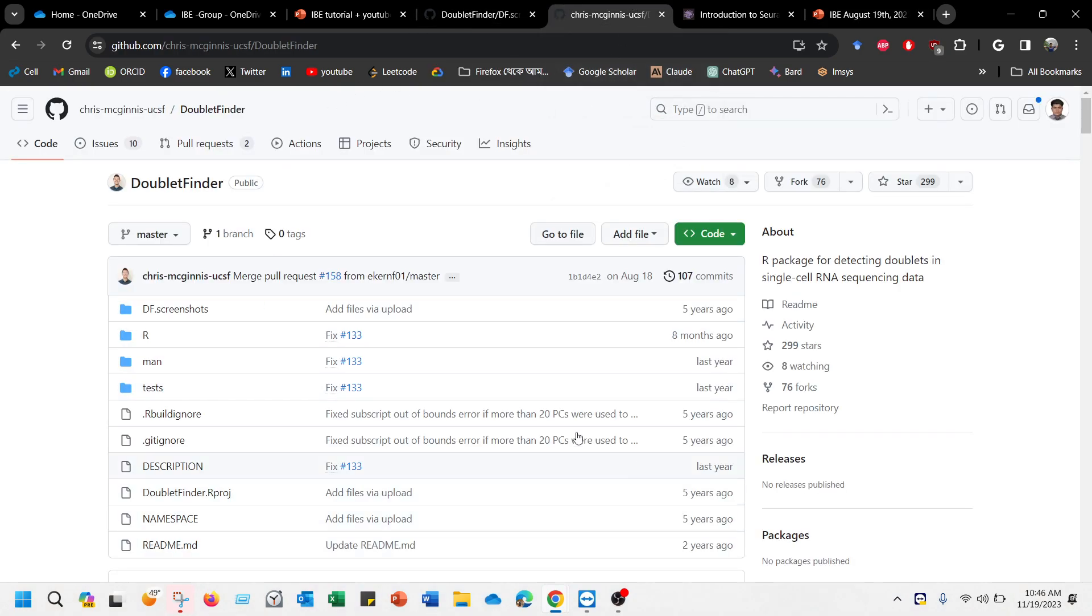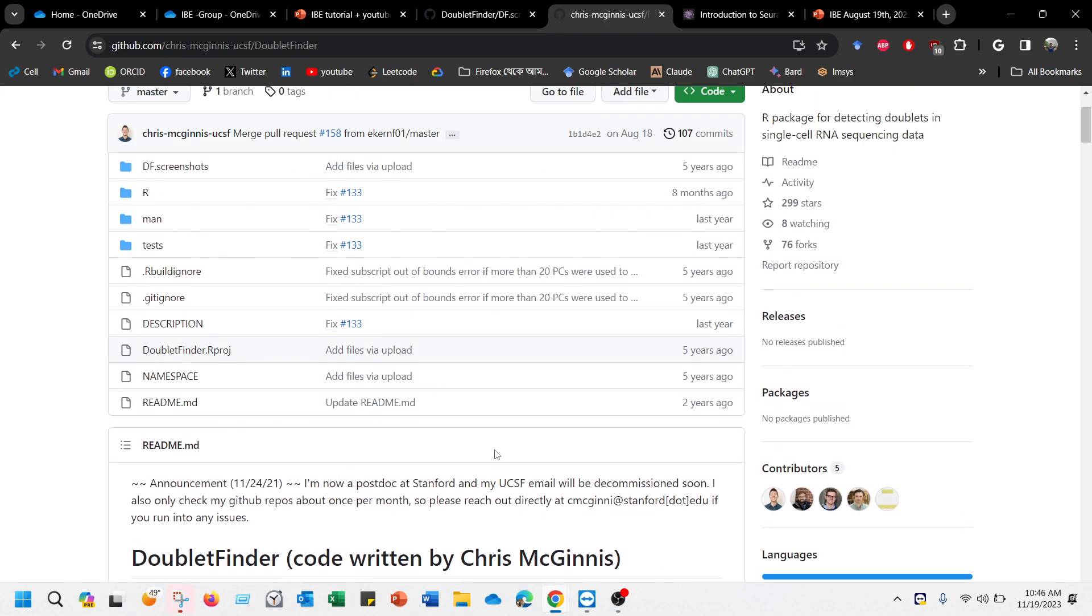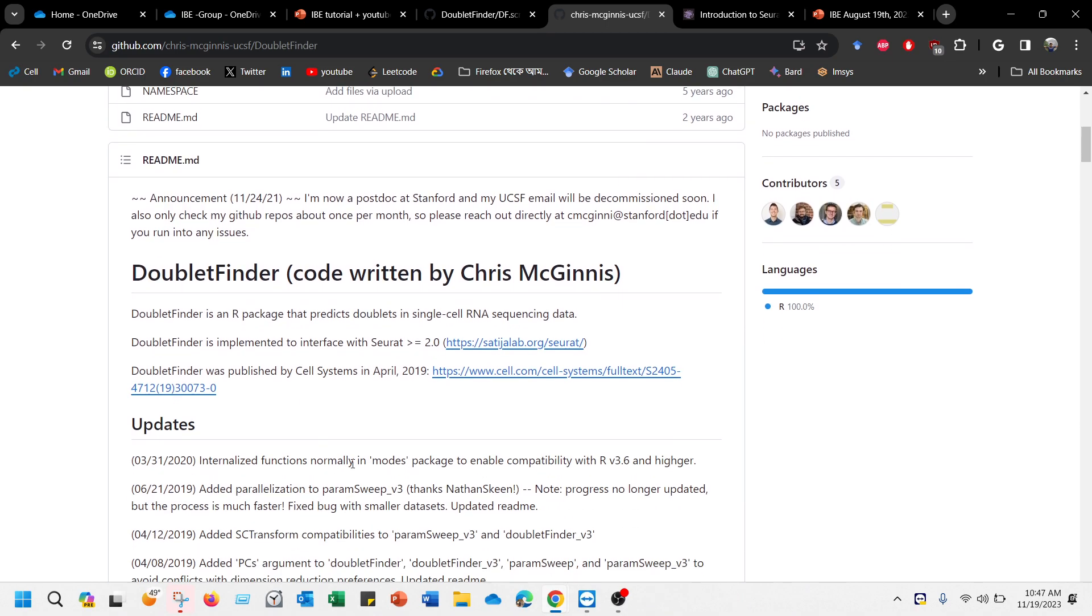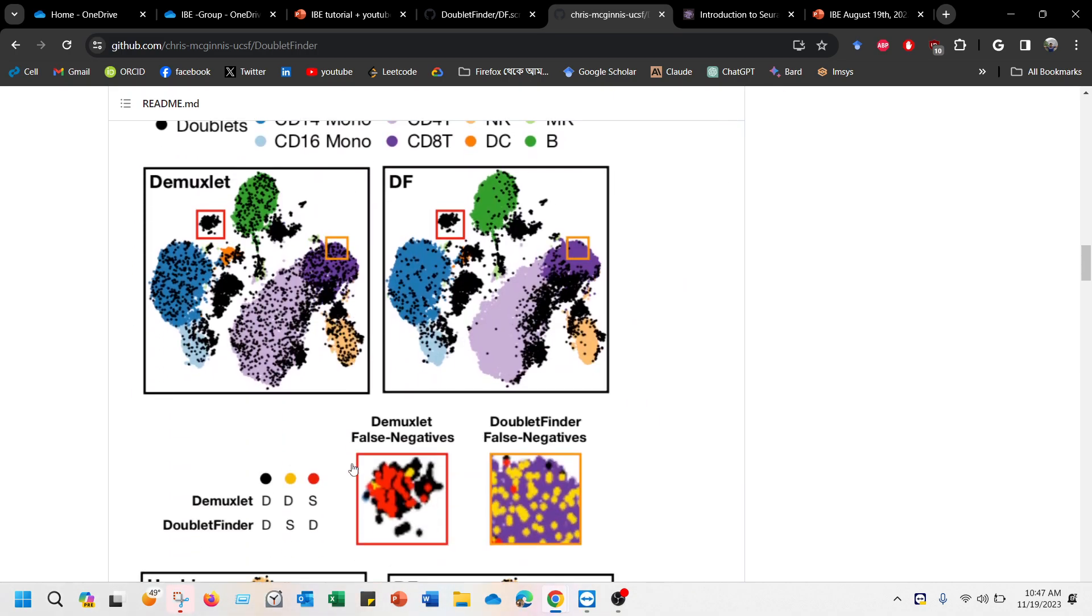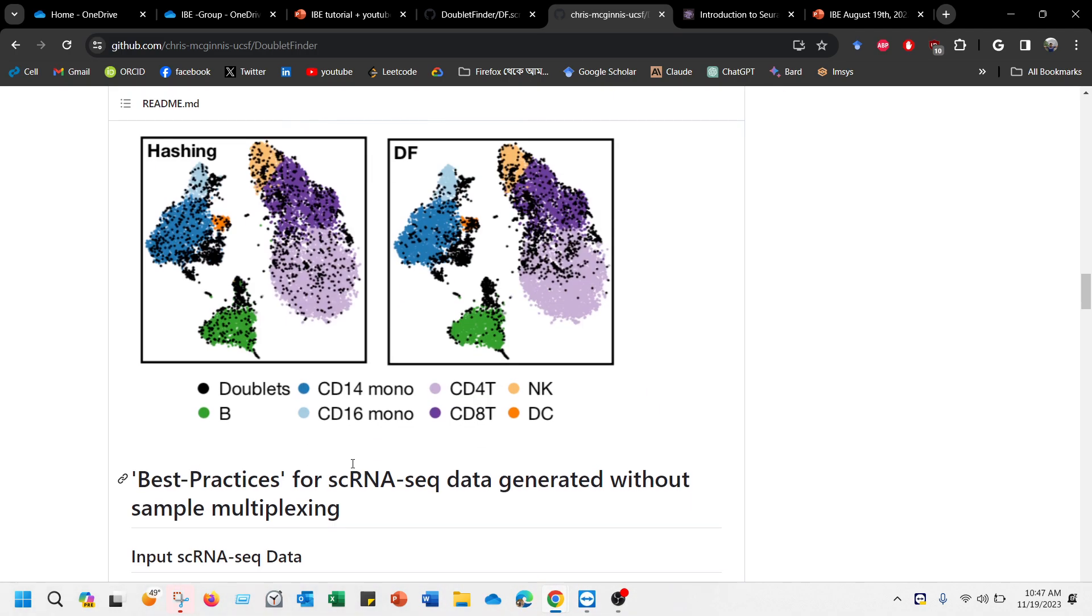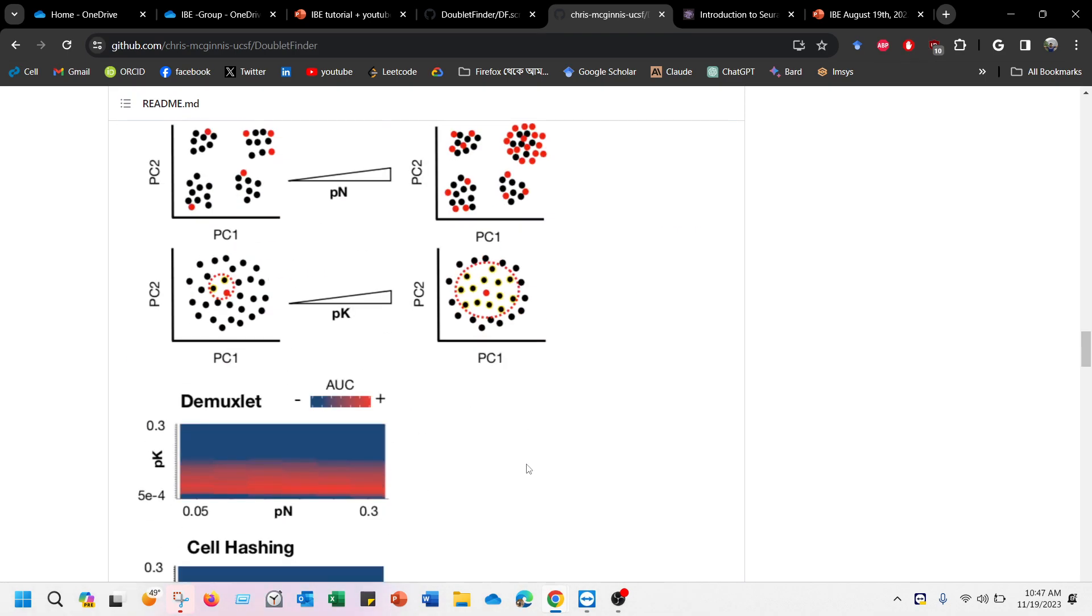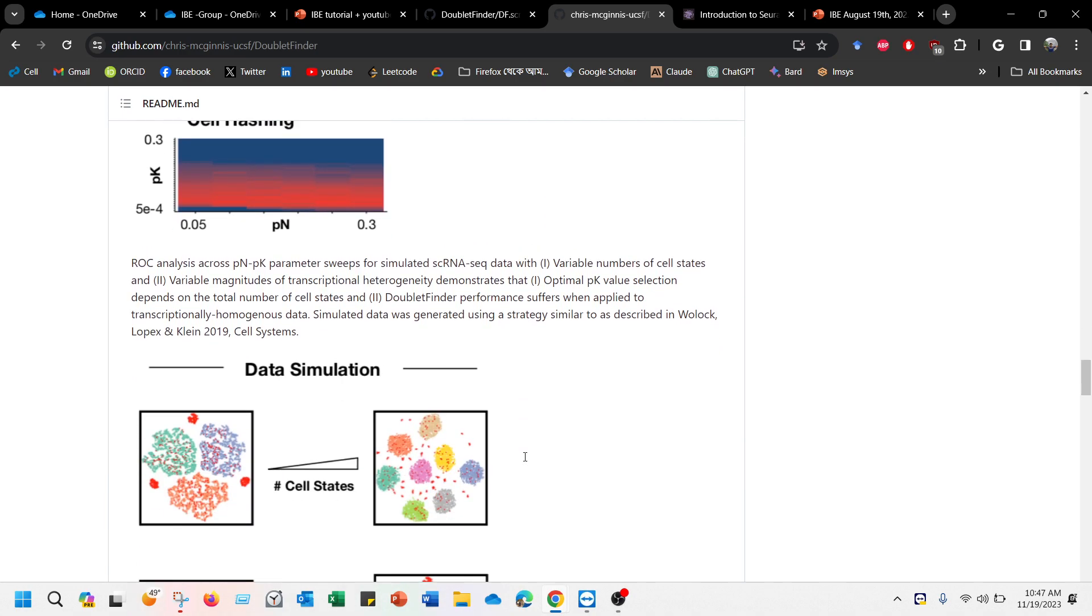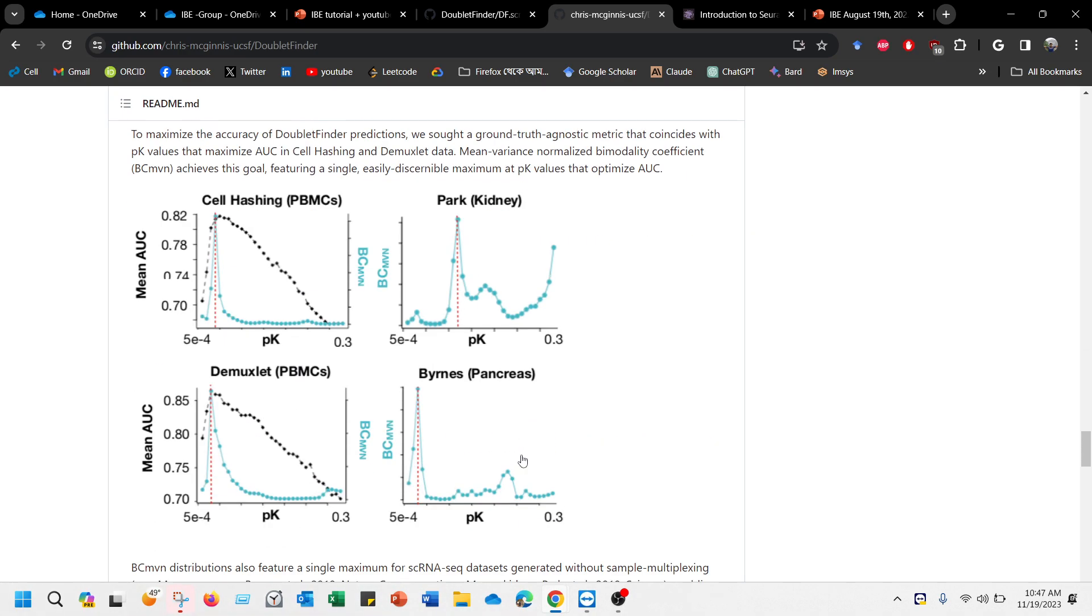It was first published by Chris McGinnis at UCSF and I'm not sure that he is regularly updating it, but either way you can see the details of identifying the doublets in here and the multiplexing, cell hashing, data simulation and many things.